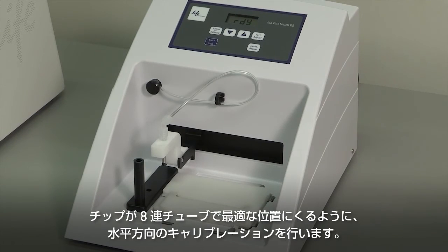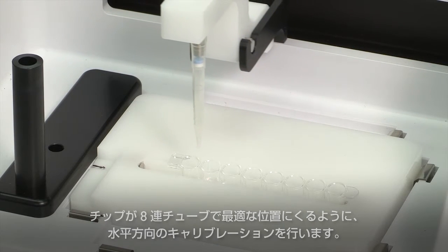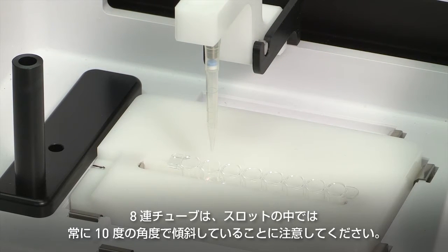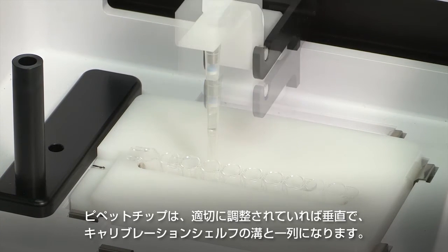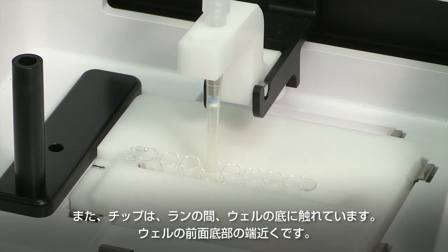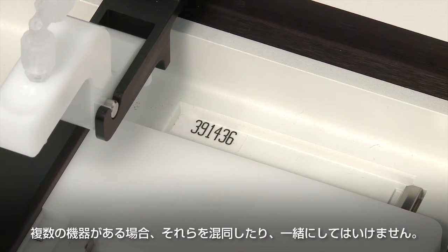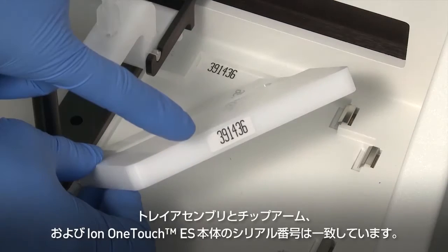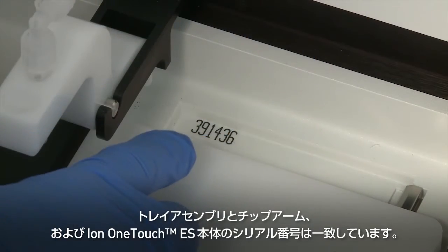Perform horizontal calibrations so that during operation the tip is optimally positioned in the well of the 8-well strip. Note that the strip is always tilted at a fixed 10-degree angle in the slot. The pipette tip is vertical. When the tip is aligned properly during calibration so that it is in line with the notch in the calibration shelf, the tip touches the bottom of the well during the run, close to the front-bottom edge of the well. The assembly is paired for each Ion OneTouch ES — if you have multiple instruments, they should not be mixed and matched.